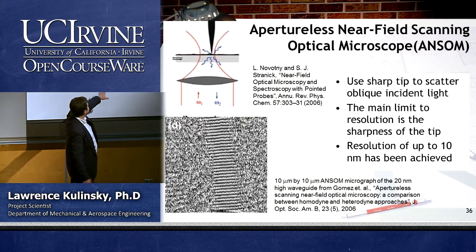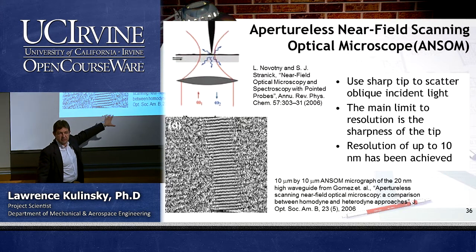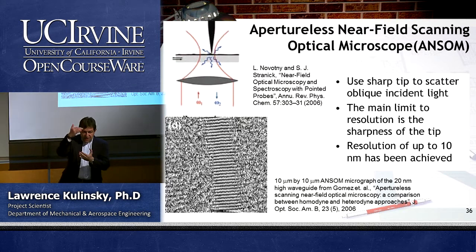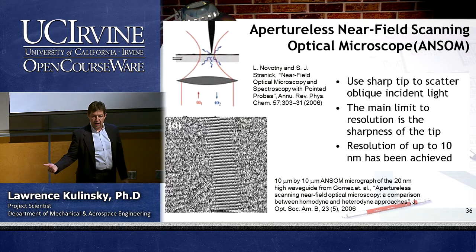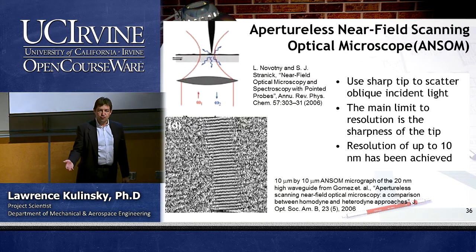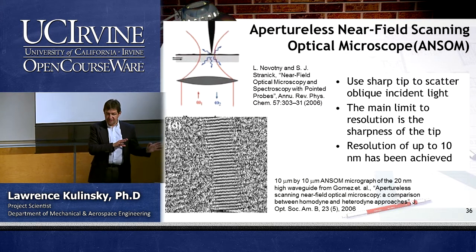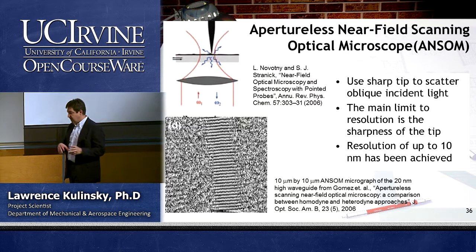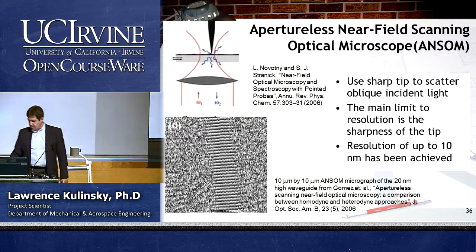So you can also have very nice resolution in the nanometer range. This is what is happening right now. People are trying to improve this technique. We're still not using it as a lithographic tool yet, just for microscopy, but it's probably just around the corner.